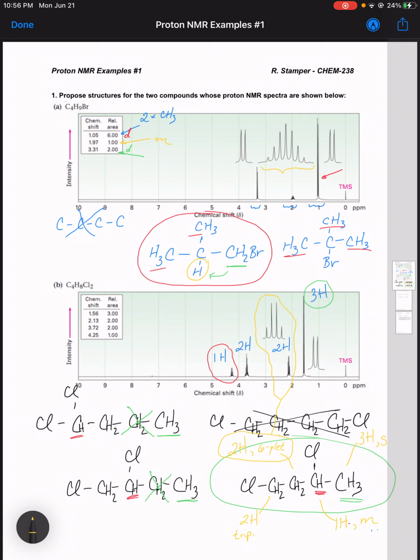So why am I seeing only 4? Well, notice that those hydrogens, the CH2 hydrogens to the left and the CH hydrogen to the right, are both in very, very similar electronic environments. They're both sp3 carbons. Those carbons are each connected to 1 chlorine. And so what I'm seeing here is basically the coupling constant for each of those splitting events is going to be very, very similar.